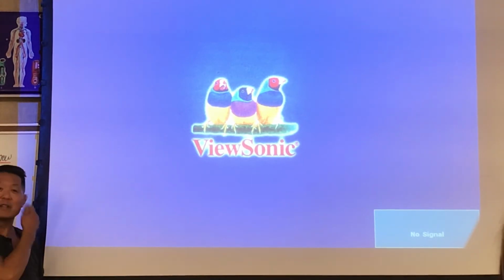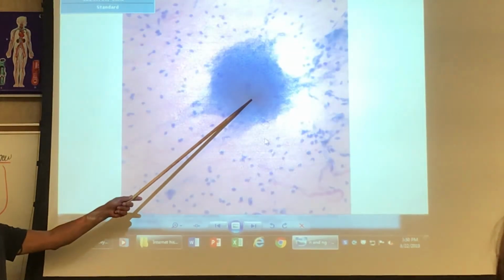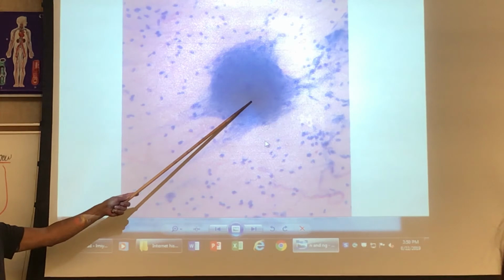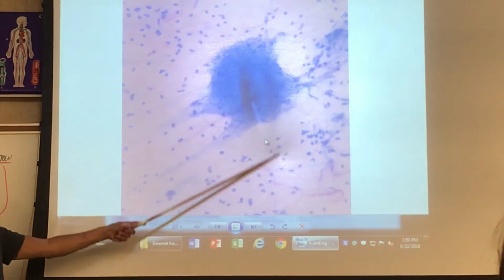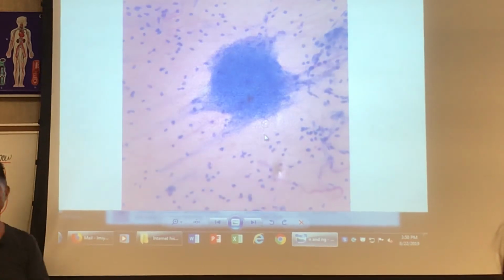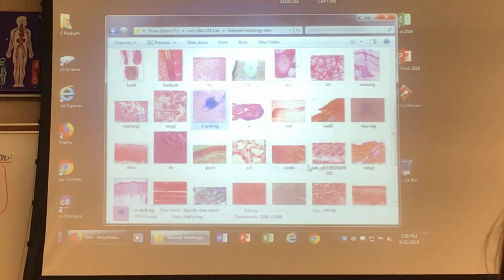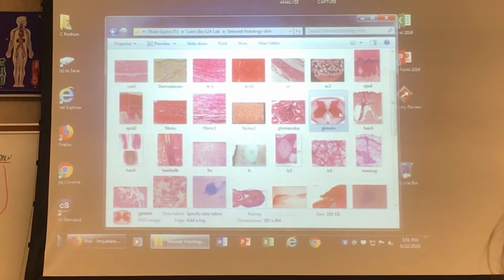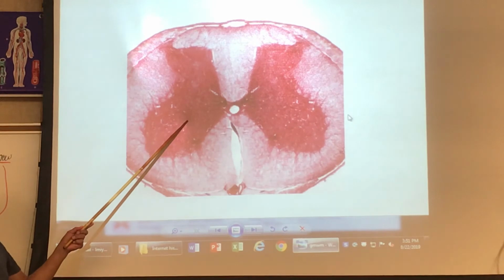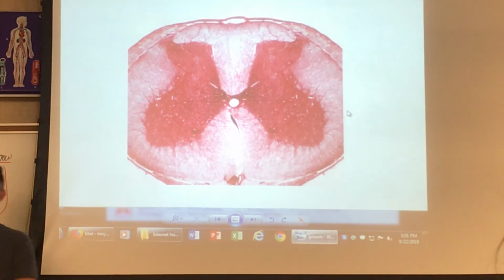You don't even have to do 20 questions. You're going to hear, what is the name of the cell? Neuron. We're in tissue type number 4. What is the name of the cell? Neuroglia. What is the name of the structure? Gray matter. What's the name of the structure? White matter. Feel better about this now?